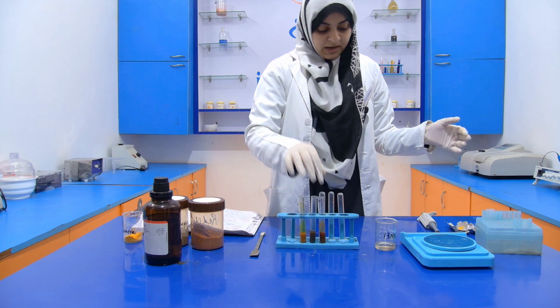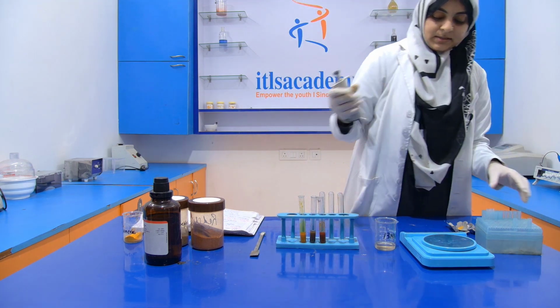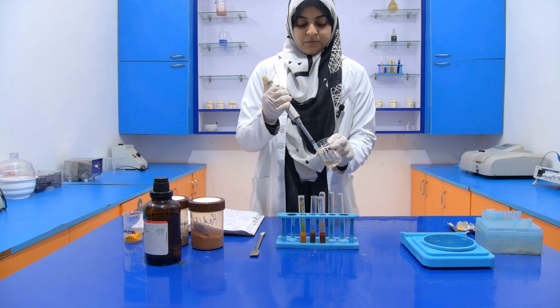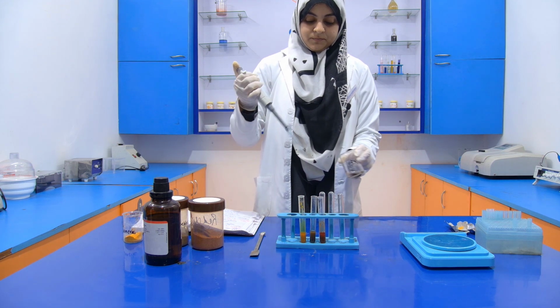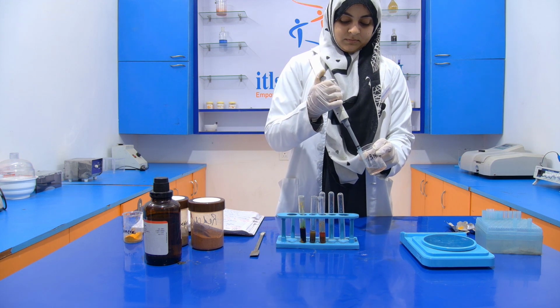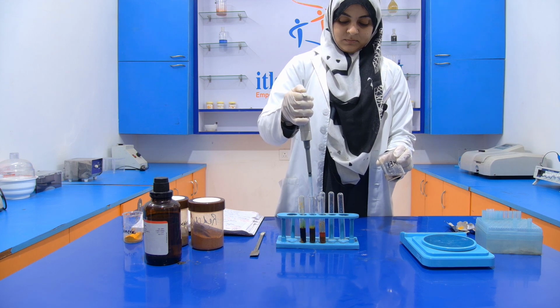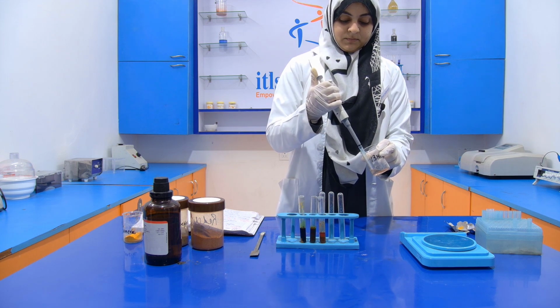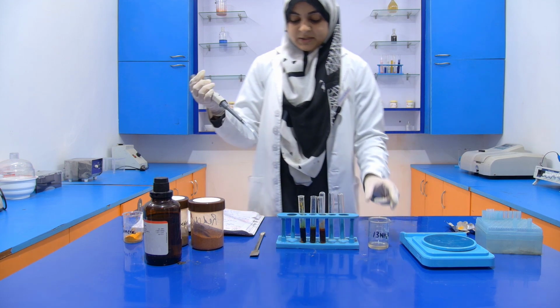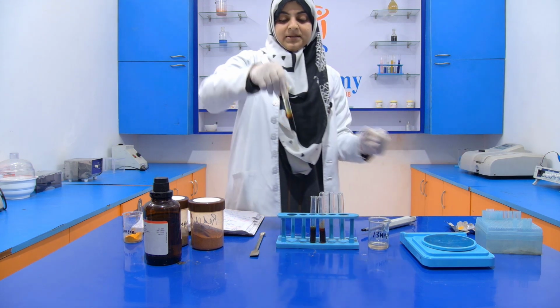Now after that, we have to add 1 ml of the 13 normal sulfuric acid into each test tube. First, second, third. If the coloring agent is present, then it will turn red. Now mix it.